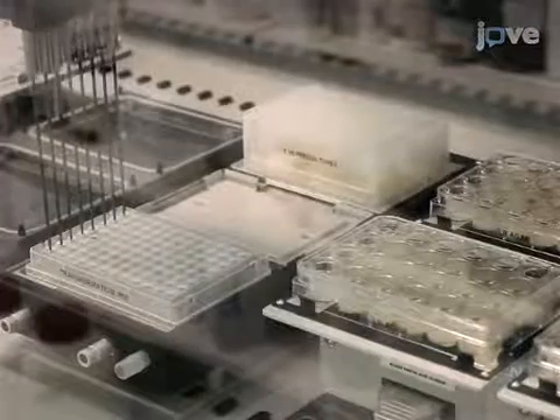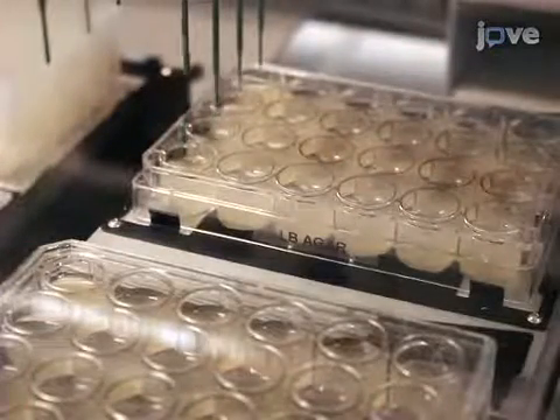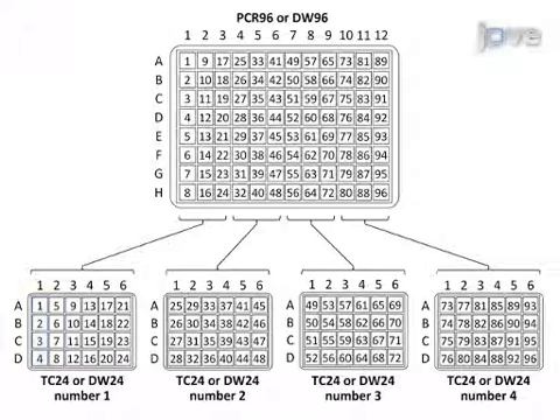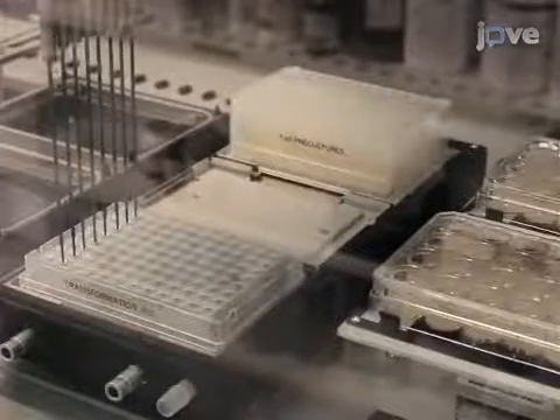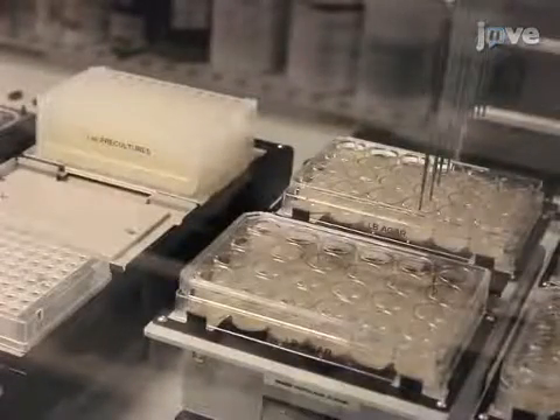After transformation of the bacteria, begin by using the robotic gripper to set aside the lid of the first 24-well LB agar plate. Use the 8-channel liquid handling arm to mix, then aspirate 50 µL of transformation mix from a 96-well transformation plate. Dispense the transformation mix within the first four channels of the liquid handling arm into the first column of the LB agar plate, and the transformations within the last four channels into the second column of the LB agar plate. Wash all the tips thoroughly after dispensing, and then continue transferring the transformation mix from the 96-well plate into all of the wells in the next four columns of the LB agar plate until that plate is finished.